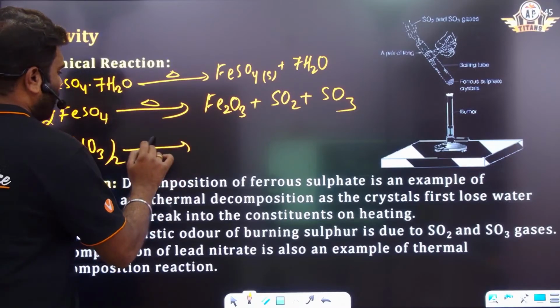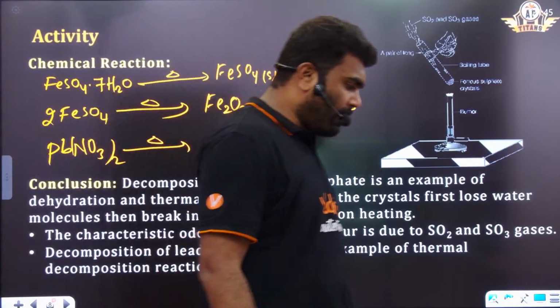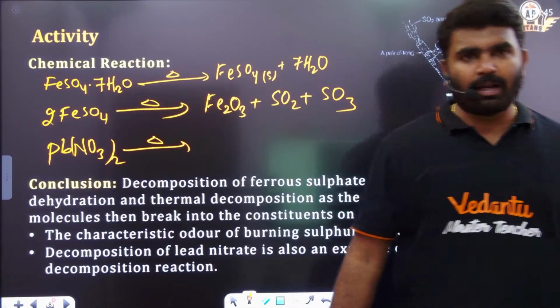taken, right? So when we heat this lead nitrate, beta, lead nitrate heat చేస్తే ఏమవుతుంది, మనకి lead oxide అనేది రావడం జరుగుతుంది.